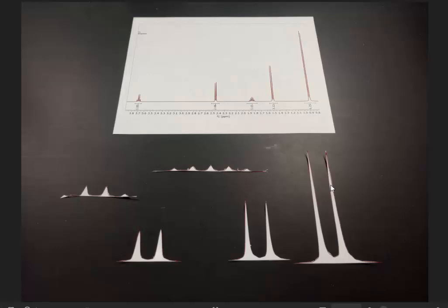But the truly global message in this entire video is that integration represents the area under the curve. And though that is best measured by a bit of calculus and employing computer technology, it is possible, and in the old days I have actually done it on purpose for a real measurement, to print out onto some relatively uniform piece of paper and then to cut out the peak in question or the curve in question in order to determine the integral by mass. The area under the curve is simply the amount of stuff represented by that curve, and the amount of stuff in the context of NMR then represents a number of protons in that environment.